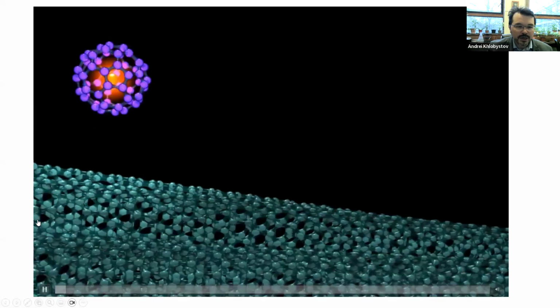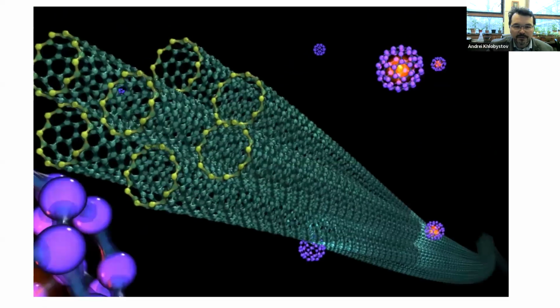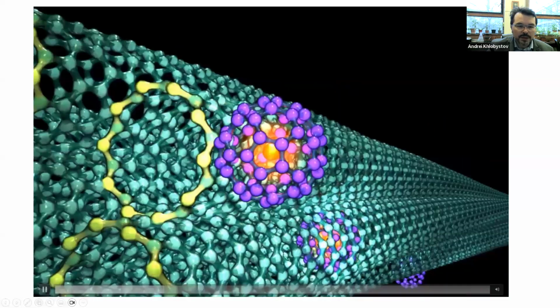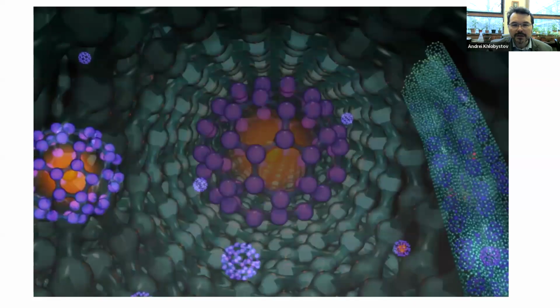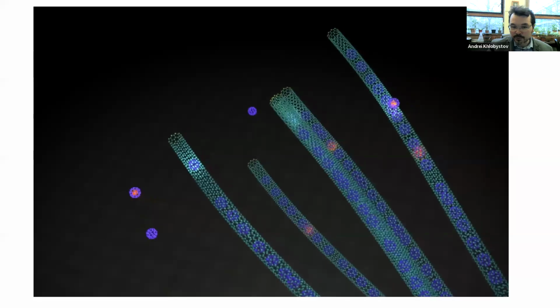Let me tell you a little bit more about the test tubes, which are carbon nanotubes in our case. They are very useful for molecules. They interact with most molecules through very effective van der Waals force. Molecules stick to the surface of the nanotubes, and then at elevated temperature, they can diffuse into the nanotube interior and become trapped. Normally this process is irreversible. Once our molecule is inside the carbon nanotube, it cannot come out. We can safely take this nanotube, place it on the TEM grid, and insert it into the vacuum of the electron microscope without any fear that we will be losing molecules during our imaging experiment.